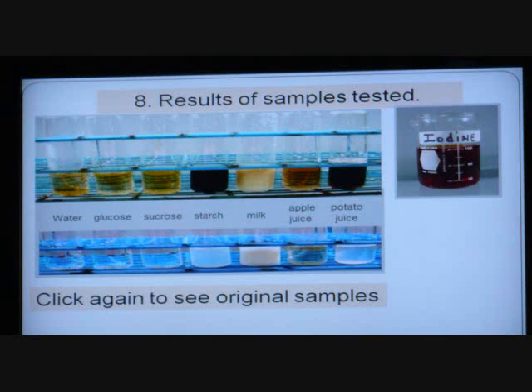And if you go forward again, the ones that reacted, I would say were really strong. I don't see a blue there at all for a weak reaction. I sure don't see a purple there. It's either yay or nay. And I got some nays and two yays over there.